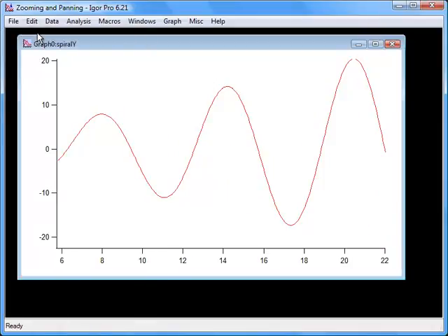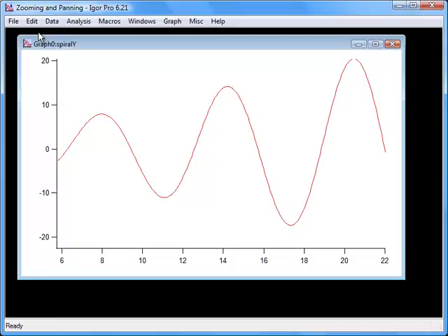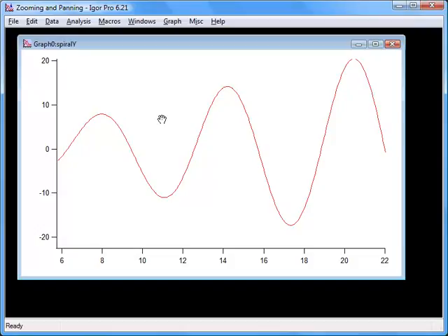To pan across the graph, press Option on a Macintosh or Alt on a Windows computer and position the cursor in the middle of the graph. The cursor will change to a hand shape. You may need to move the cursor slightly before it changes shape.